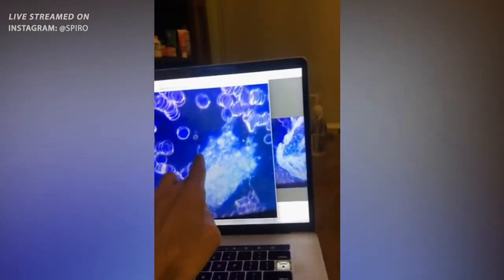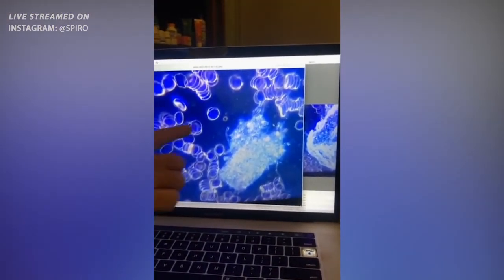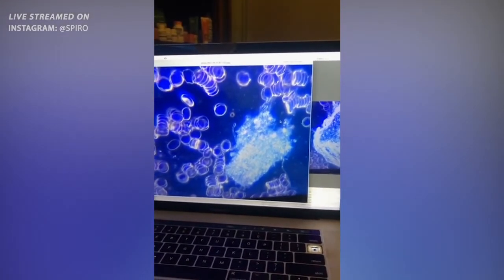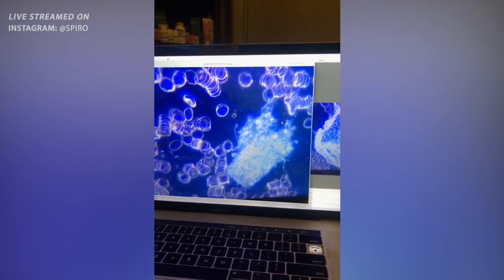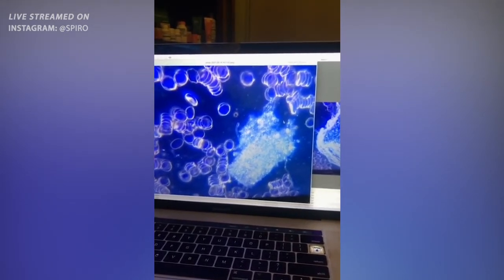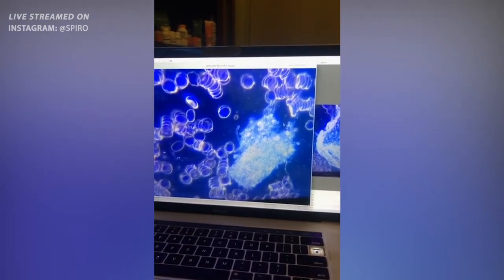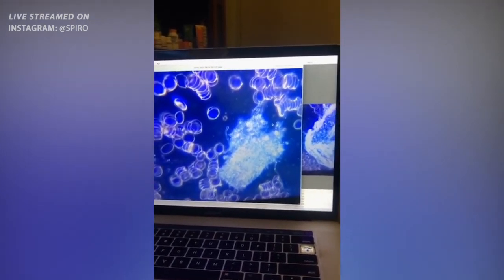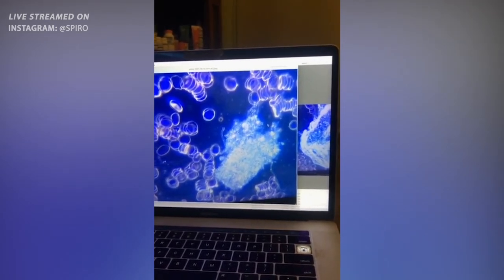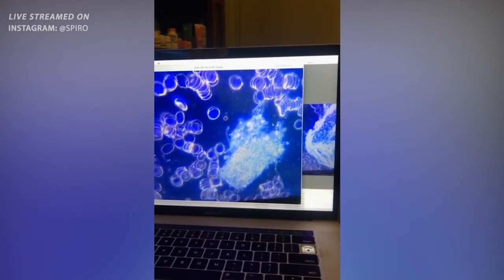So that here, right? This crystallized structure. They weren't moving like this, but they were kind of growing, sticking out, right? Yeah. Wow. This is insane, guys. So the doctor has found, when she was looking at this live under a microscope, that this crystallized structure was interacting, was growing, was sort of like a network.